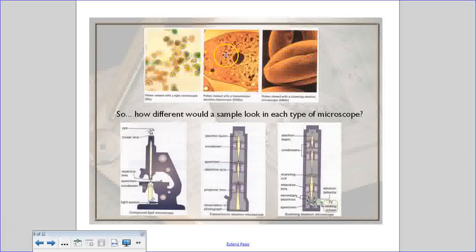So these are both two-dimensional. You can't really tell what the whole surface of the thing looks like, but it's kind of like a slice through it. This is almost like a cut through it, and you're looking at the section of the pollen grain in more detail. Depending on where the cut or slice is, you might see certain features of it, and you might not see others. If you're slicing through a cell, then maybe you'll see a mitochondrion, but you might not because there might not be one in that particular section, for instance.